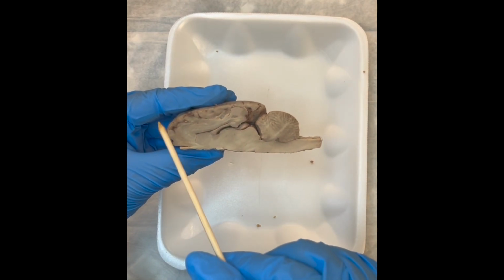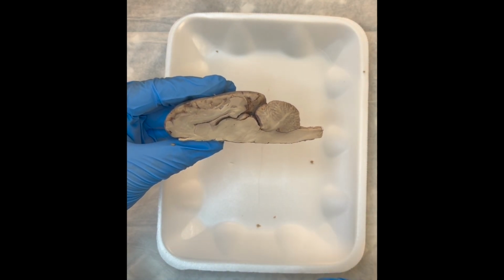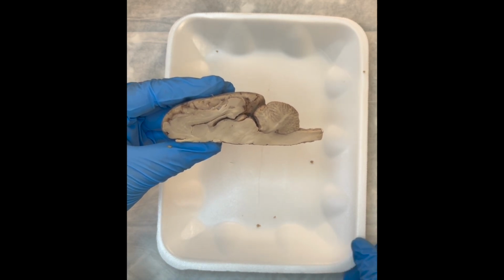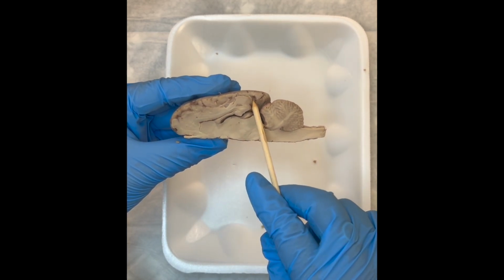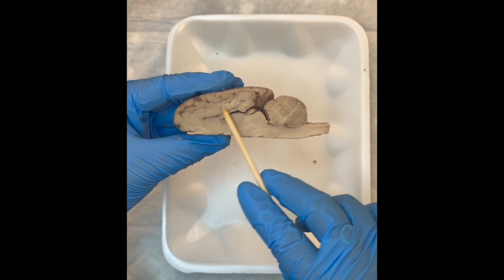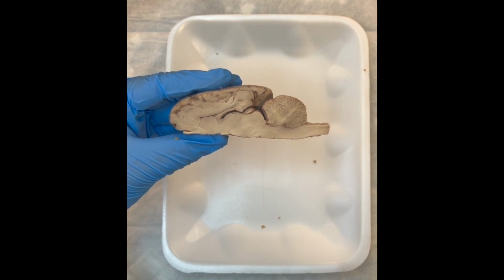So we're going to notice that we have the cerebrum here. We can see the gyri and the sulci, and that's because there's quite a separation between the left and right cerebral hemisphere, right? And that's due to that deep longitudinal fissure. The point in which these hemispheres make contact is at the corpus callosum. So you're going to see a change in tissue types, a little bit smoother, whiter in color. This is where those fibers communicate between the left and right half.